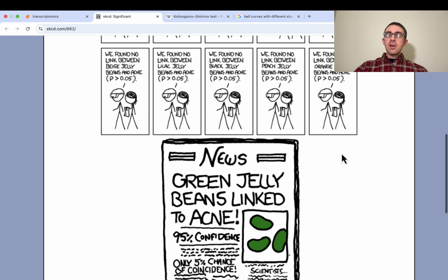And then, like usual, just a little sanity check, making sure that these have the correct shape. Yeah, so 103 samples each. And then we can do the KS test with this SciPy stats function. This will do the KS test and then give us the p-value. It happens to be the case that for the very first gene, the two observed distributions for the control and IPF conditions actually were pretty different, because this p-value is very low here.